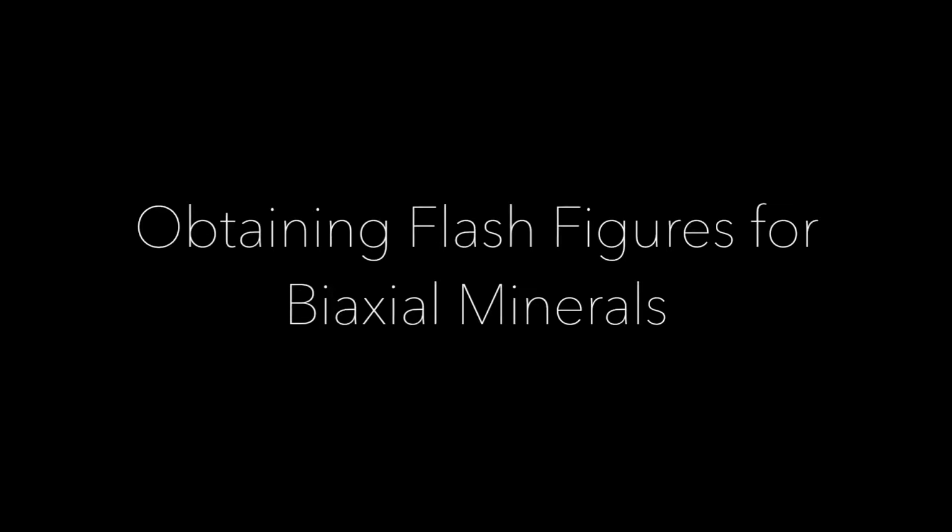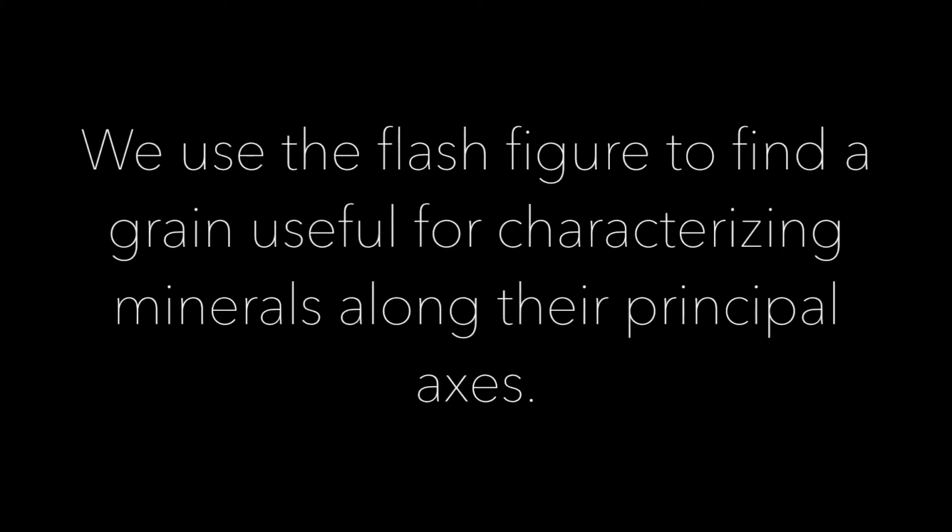Today we are learning how to obtain flash figures for biaxial minerals. We use the flash figure to find a grain useful for characterizing minerals along their principal axes. This will tell us how our mineral grain is oriented.